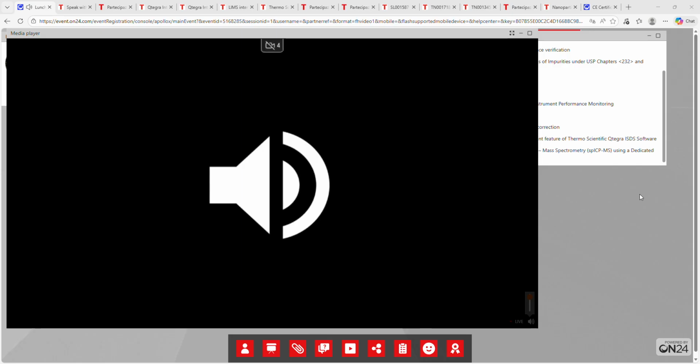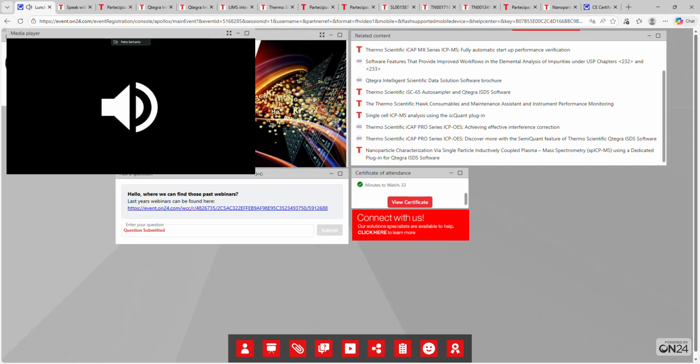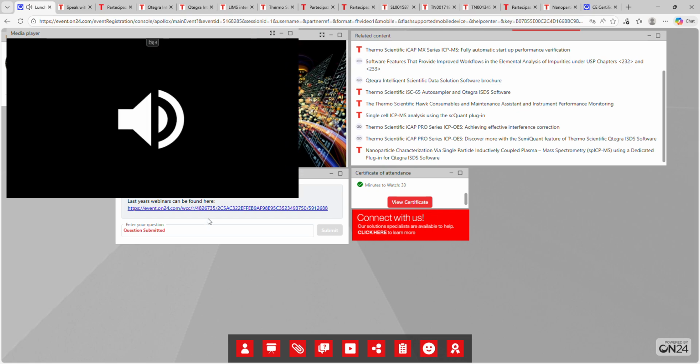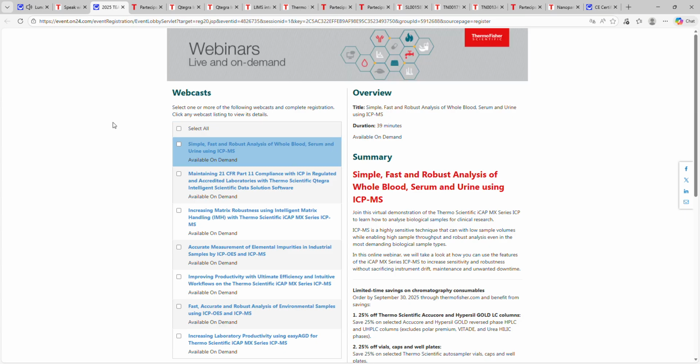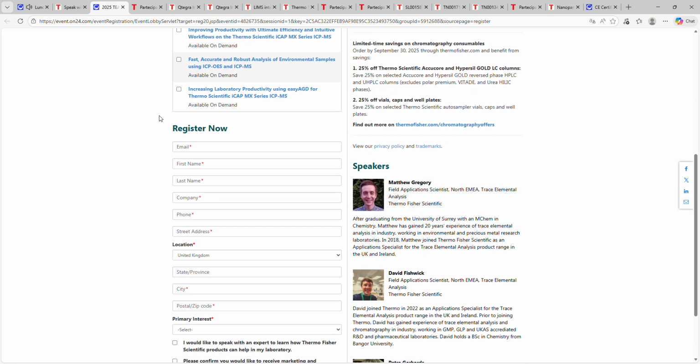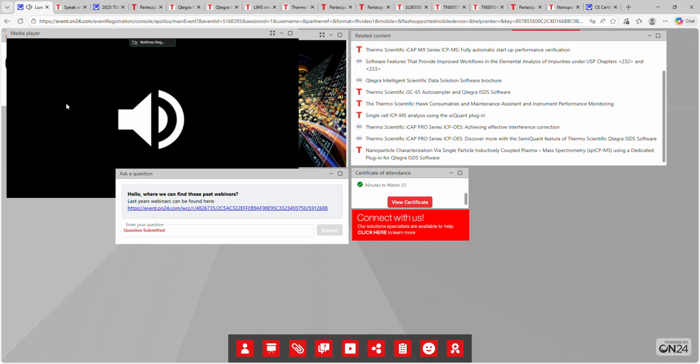So coming to the next question. In blank water itself, my nickel iron counts are more than 10,000. I changed the tubings, cone, nebulizer, but still my counts were high. Probably quite difficult to answer without a bit more context, but it could be contamination.